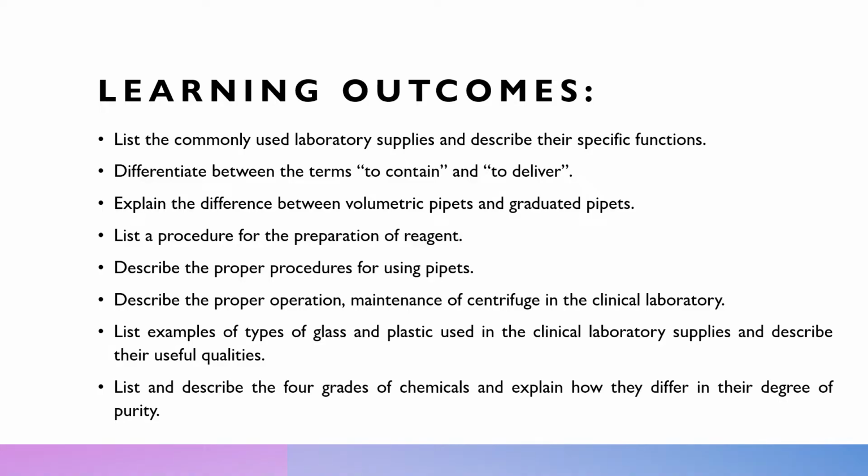List examples of types of glass and plasticwares used in the clinical laboratory and describe their useful qualities. And lastly, list and describe the 4 grades of chemicals and explain how they differ in their degree of purity.